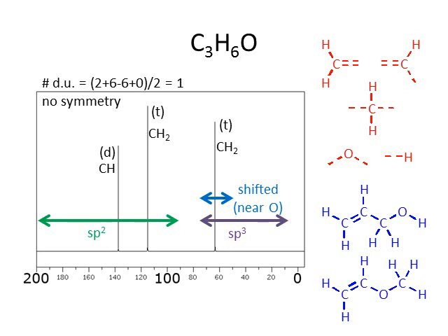Now I'm going to go back and check my work, and hopefully one fits the data and the other does not. All right, so what do I know? Do I have 1 degree of unsaturation? Yeah, that one has 1 degree of unsaturation, so does that. Do I have no symmetry? Well, this one doesn't have any symmetry, so that fits that. Same here. This one also doesn't seem to fit that. Do I have 2 sp2 hybridized carbons and 1 sp3 hybridized carbon? Yeah, that's true of both.